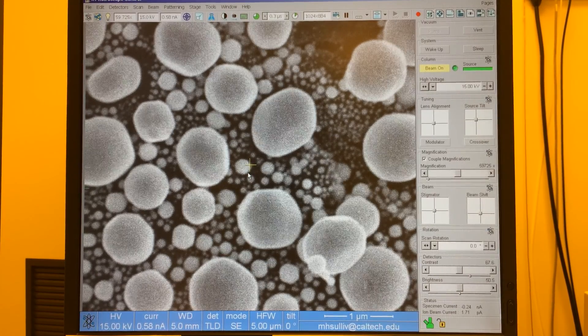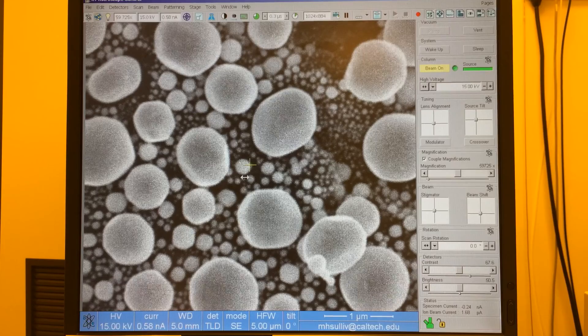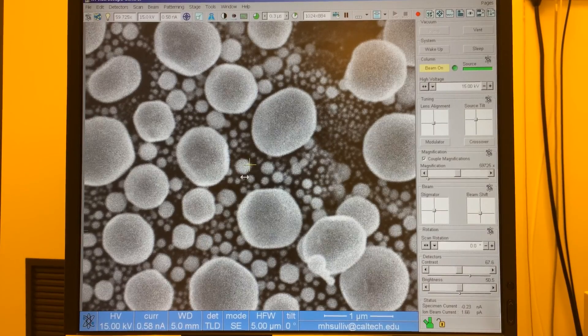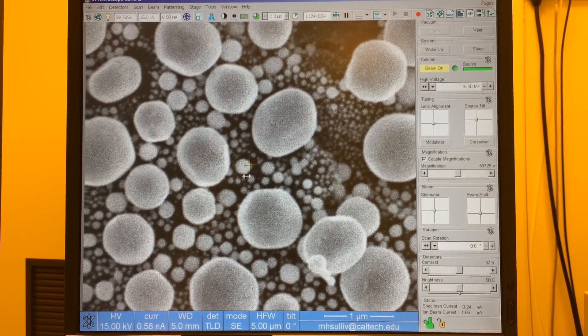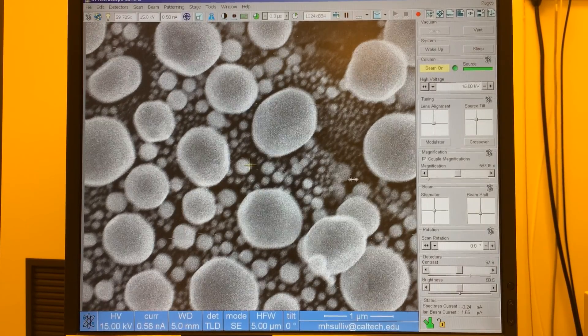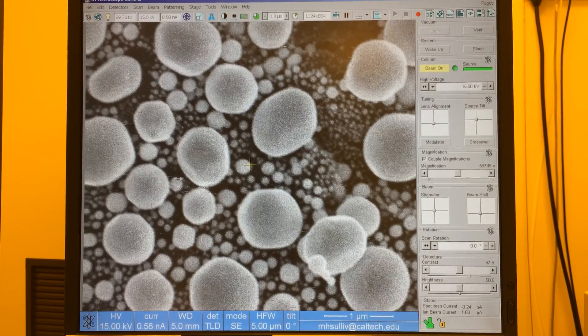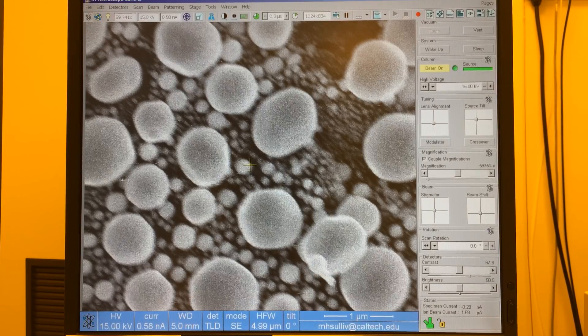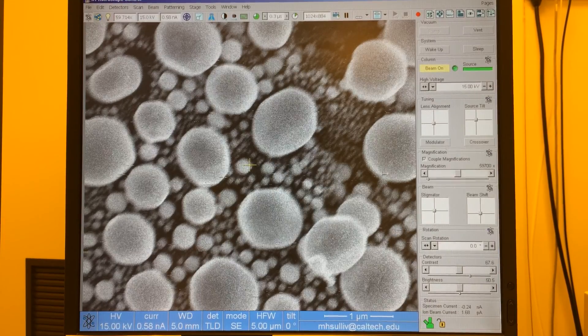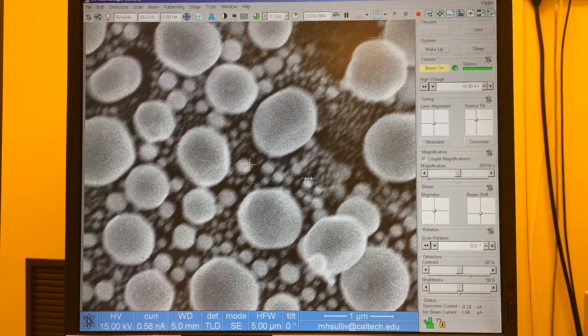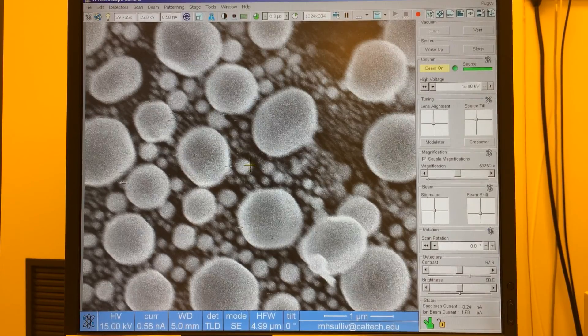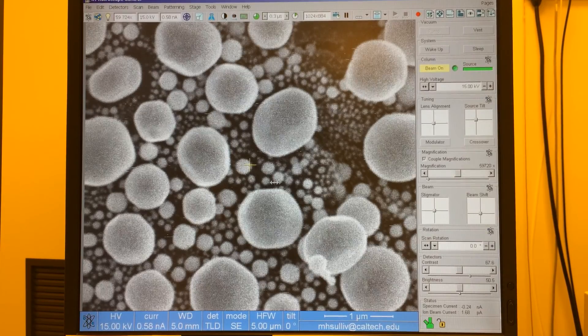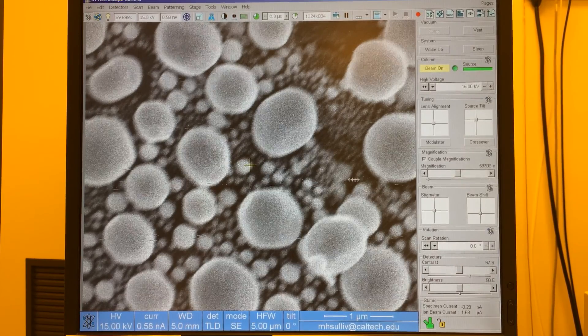In our basic alignment procedure we use focus to show us what's wrong with the alignment. When we right click for focus and we focus to the right, in the left we're looking for some visual cues. If we see stretching in the image we know we need to fix astigmatism. If we see shifting in the image then we know we need to fix the lens alignment.